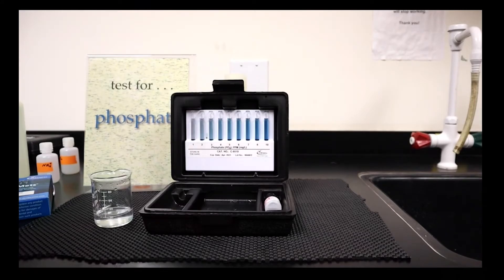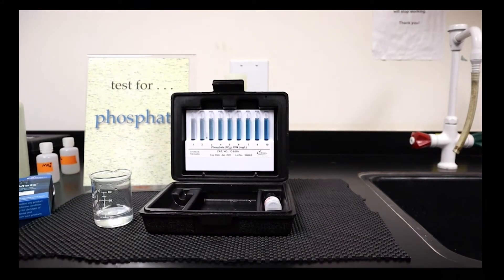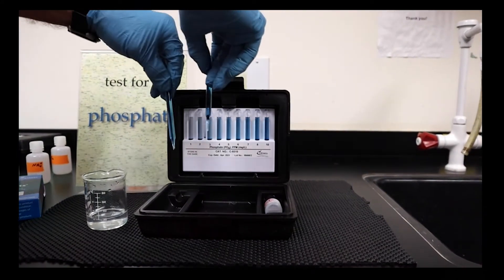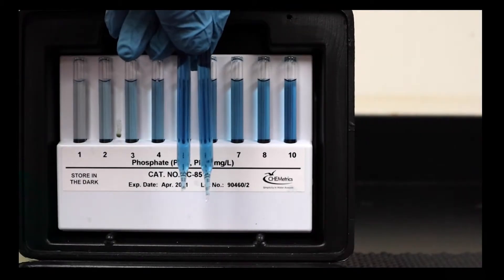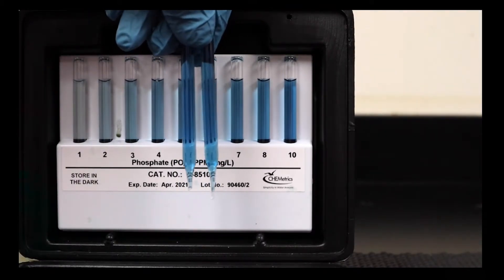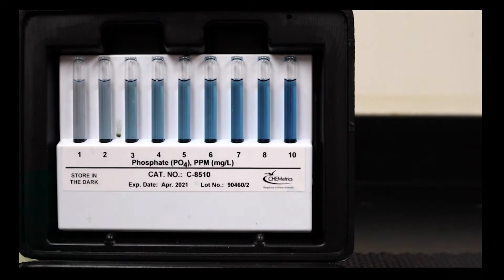I would say that this is about 70% of what we had in the first sample. So, more dilute. If we compare the two, the first and the second, you see that the guy on the right is definitely darker than two.